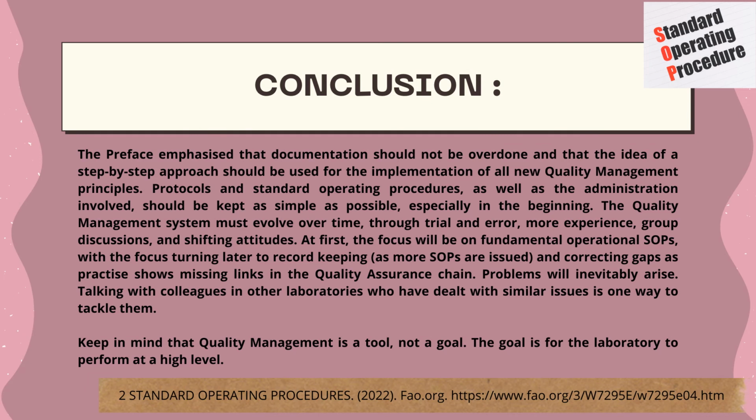The protocols or the SOPs should be kept as simple as possible, especially in the beginning. Keep in mind that quality management is a tool, not a goal. The goal is for the laboratory to perform at a high level.